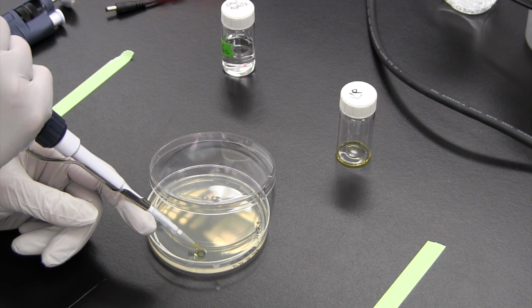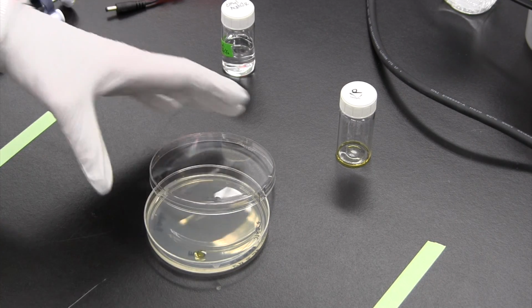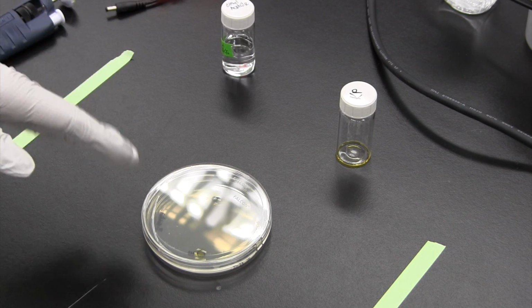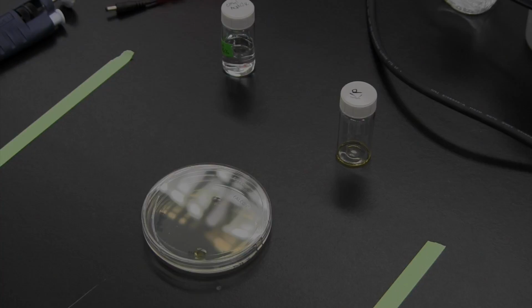And you want to add this somewhat slowly so that it doesn't spread too far onto your plate. And that air bubble will pop off as it dries. Okay, now we would just wait for that to dry, and we would repeat that 2 more times, so you have 30 microliters of extract, 30 microliters of your control, and then you'll be ready for your next step, which is to pour the agar overlay.